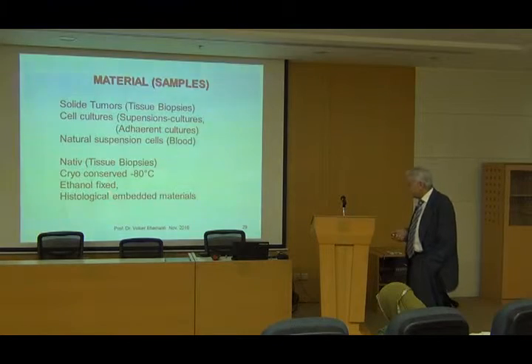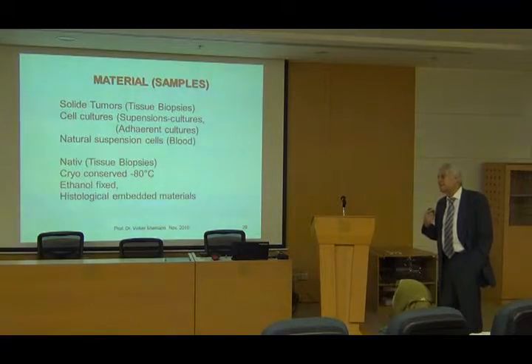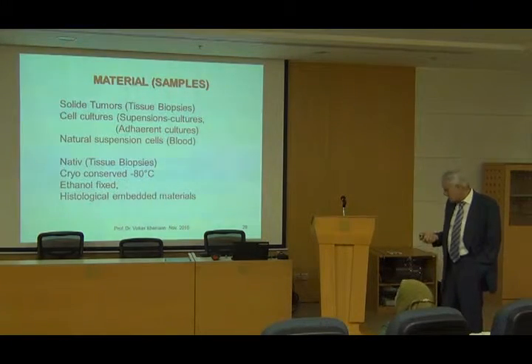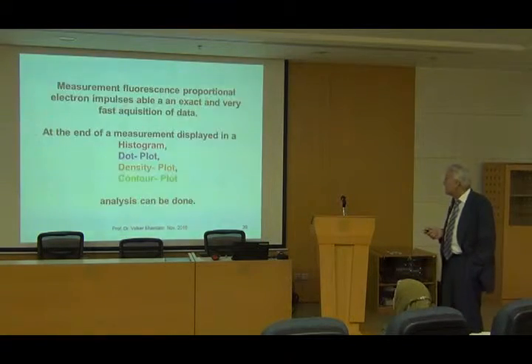But the method to separate single cells from histological embedded materials is very complicated and takes a long time to dissolve single cells from embedded tissue. But it's possible. It just takes a very long time.